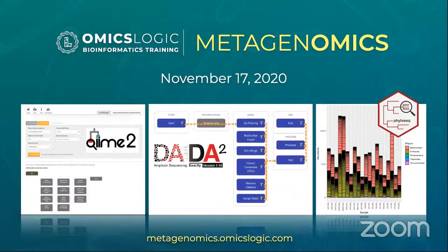But before we begin, let's see how sequencing technology has changed the way that we can study microorganisms and how specific metagenomic or microbiome data analysis tools were developed for studying communities of microbes, or microbiota, to characterize them in terms of their diversity, species richness, and differences between different groups of samples, which allows us to ask specific questions and associate microbial diversity with health and disease.